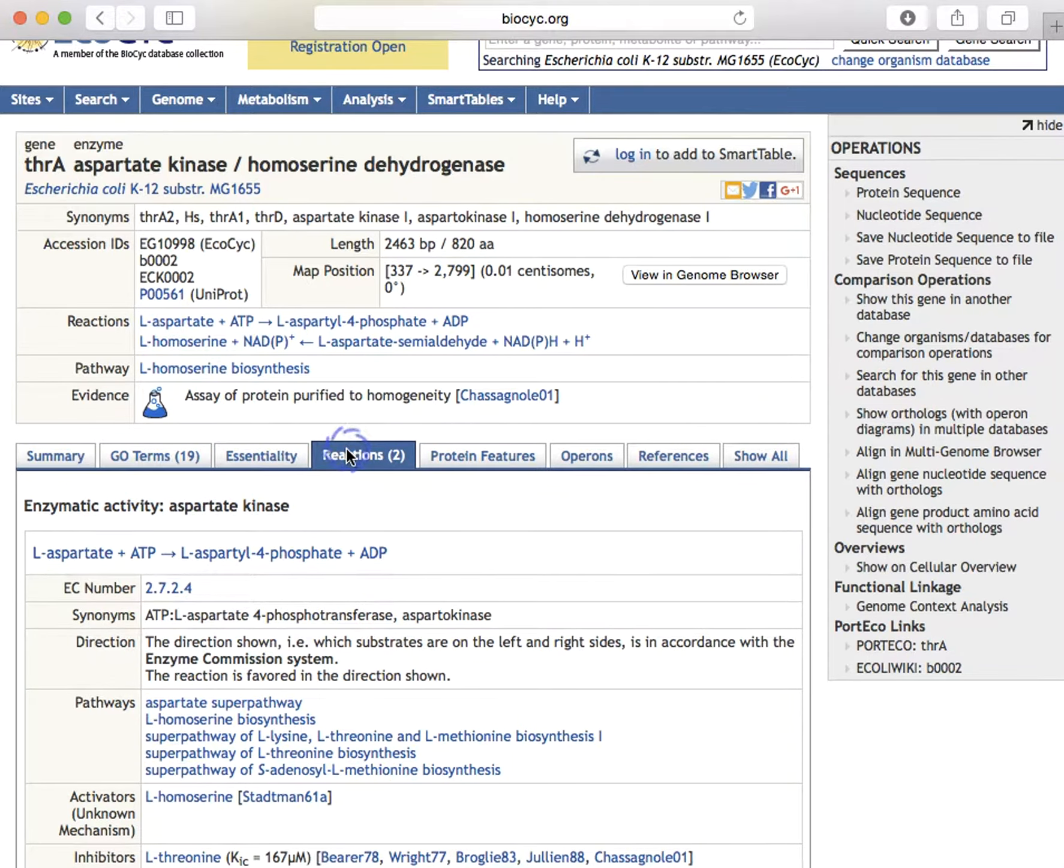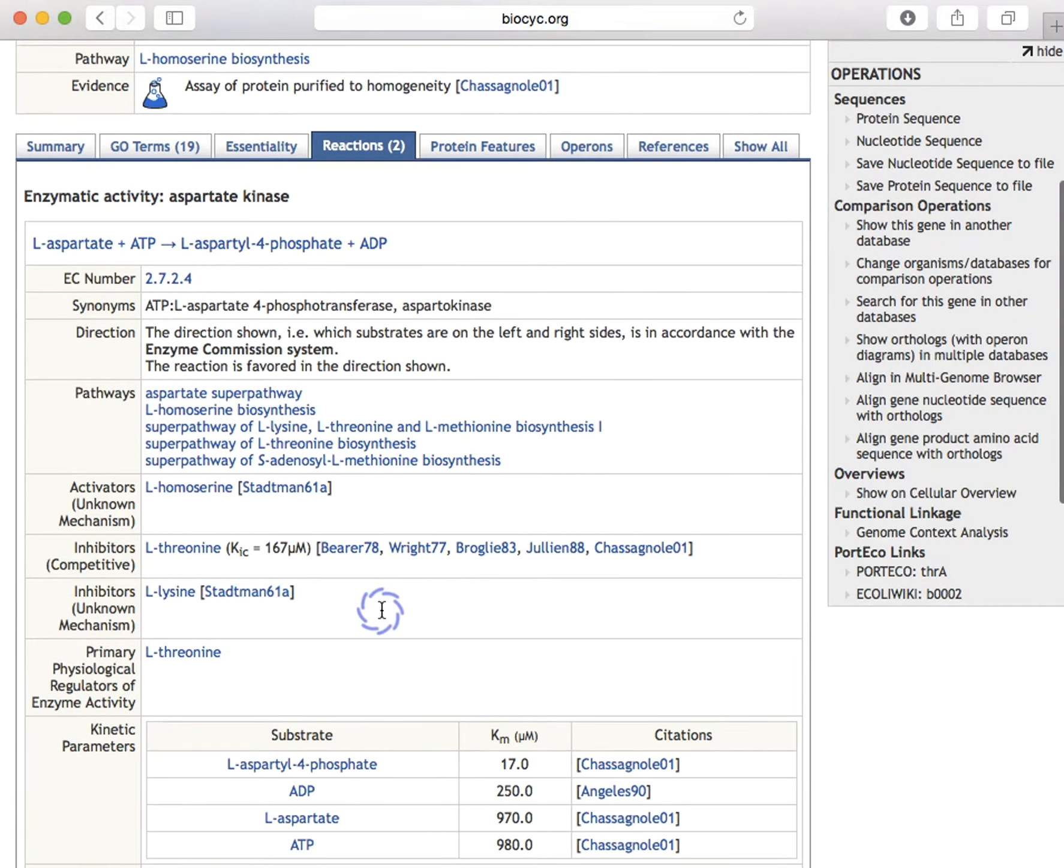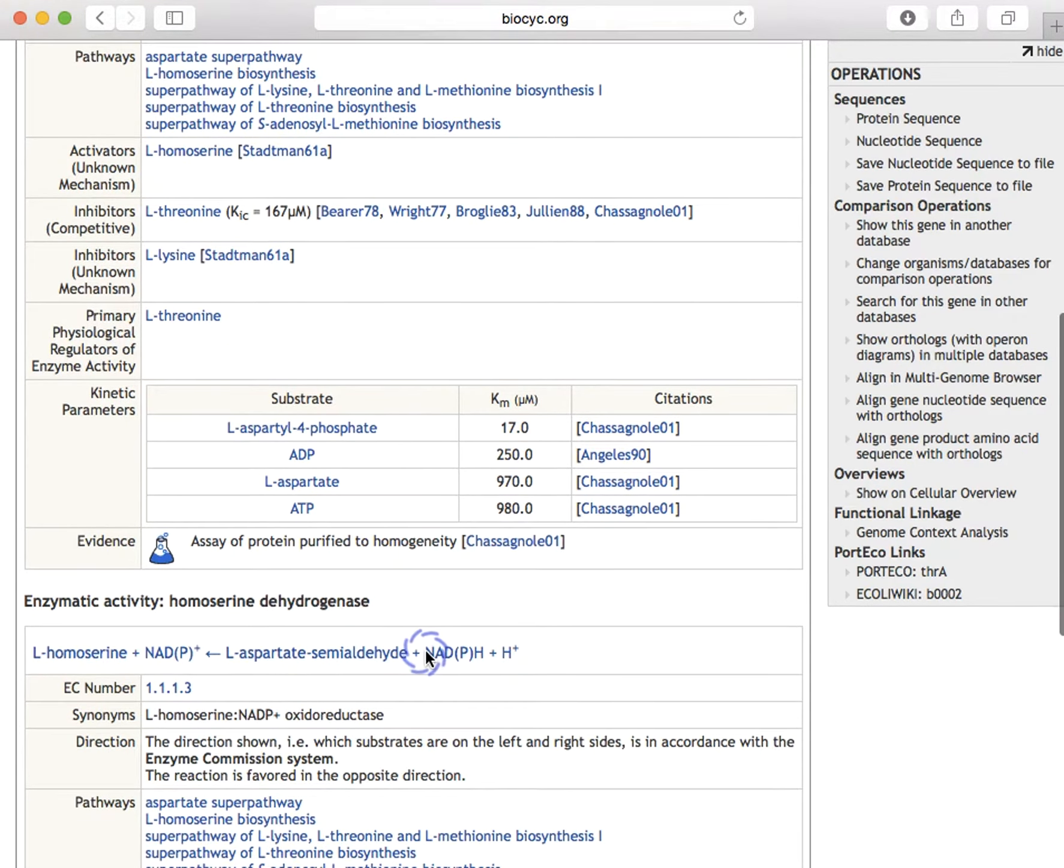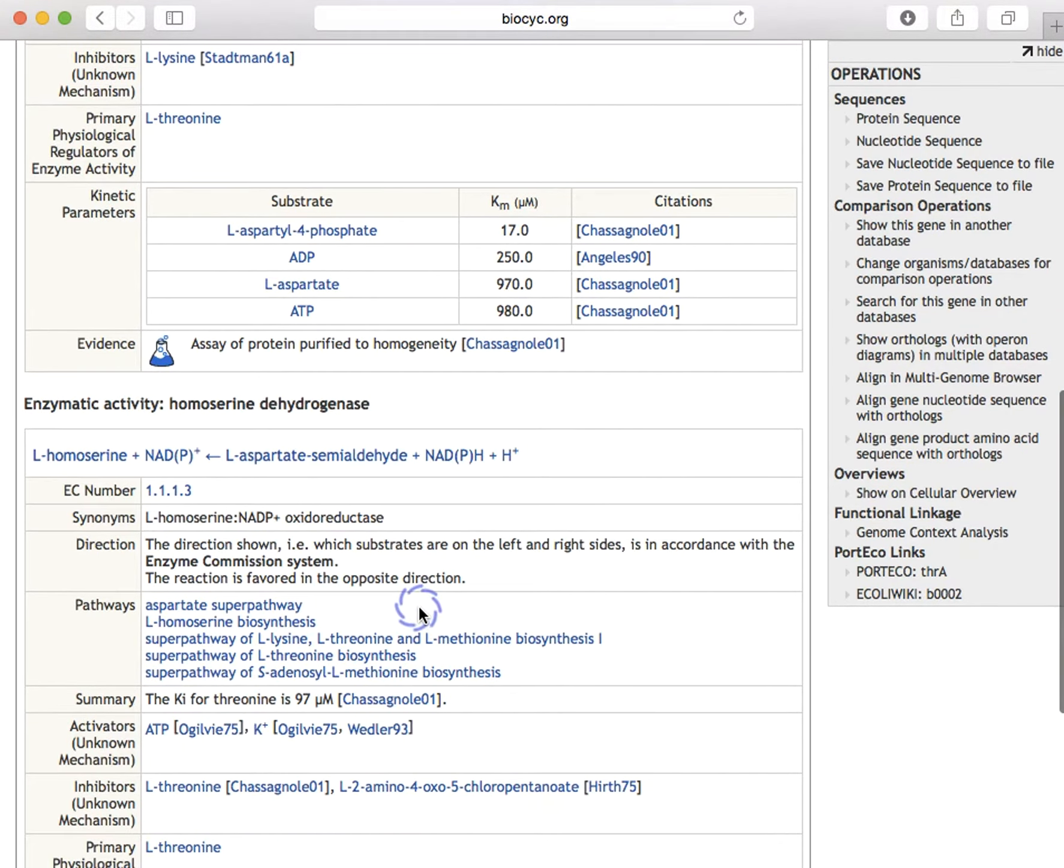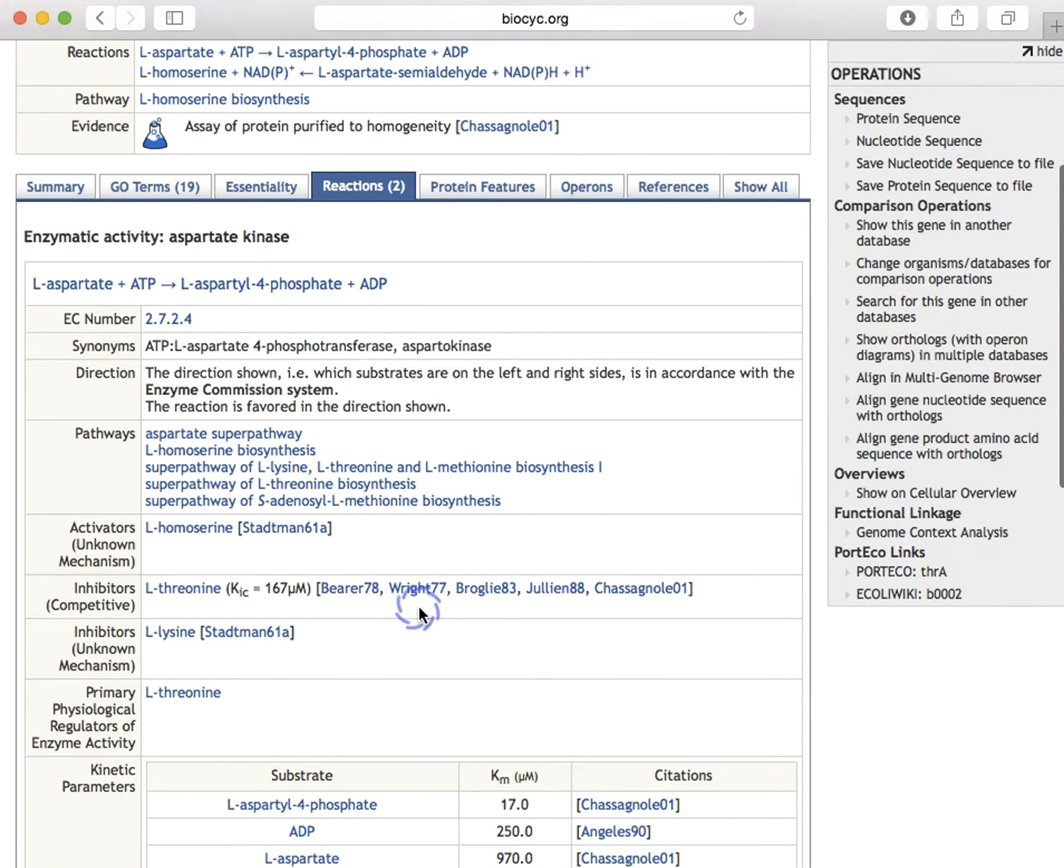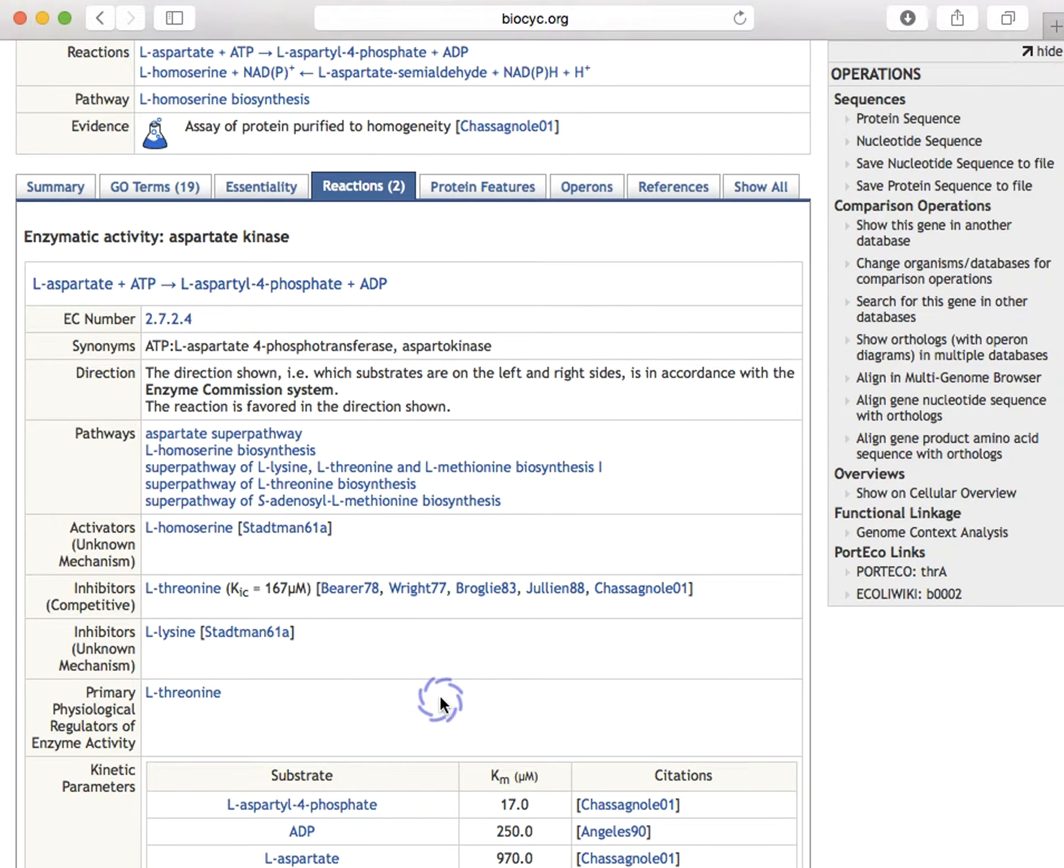The reactions pane lists the reactions catalyzed by the gene product, in this case two reactions, the first in this first table and the second in the second table here. Because an enzyme with multiple active sites may respond to different activators and inhibitors at each site, we list the activators and inhibitors separately for each reaction.